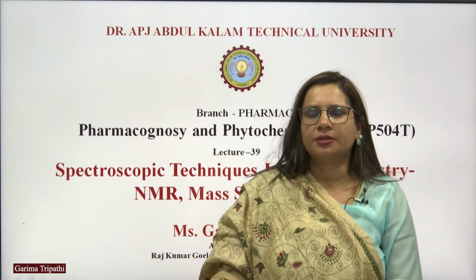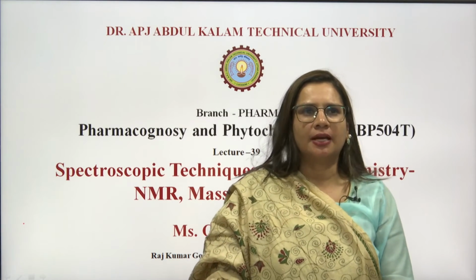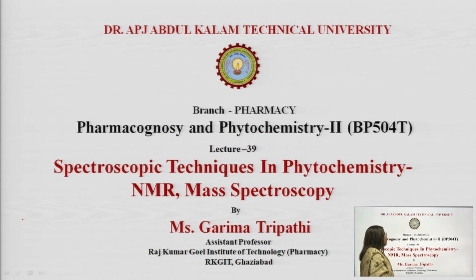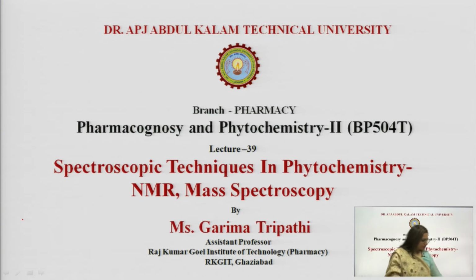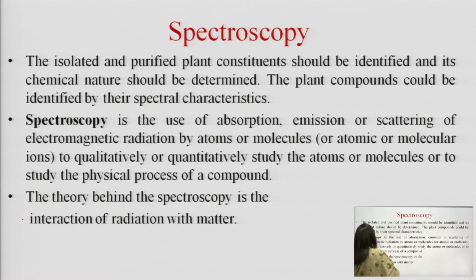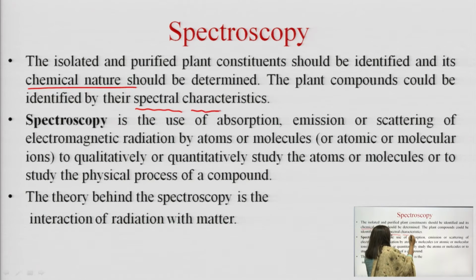Today we are going to discuss the topic spectroscopic techniques in phytochemistry, NMR and mass spectroscopy. The isolated and purified plant constituents should be identified and their chemical nature should be determined. The plant compounds could be identified by their spectral characteristics.